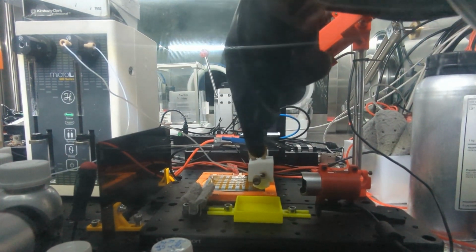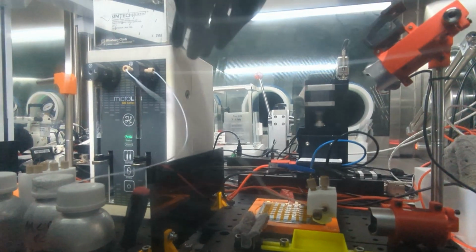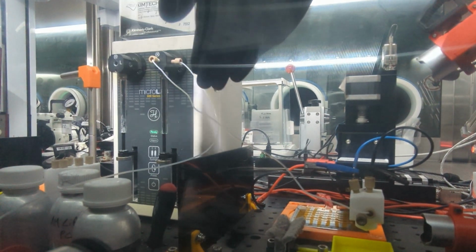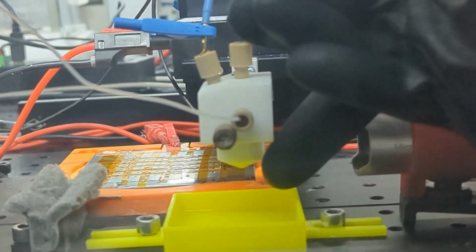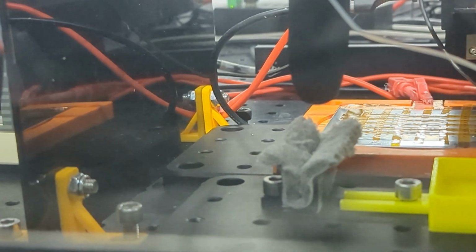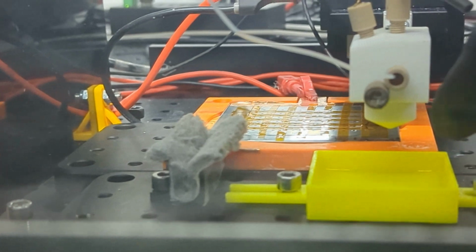The electrolyte is introduced through an inlet which connects to a syringe pump manufactured by Hamilton company, and the user can attach a tube to this pump filled with any electrolyte of choice. The electrolyte is aspirated by the pump and then dispensed from the SDC head into a waste holder. To address the issue of residual electrolyte, which can lead to salt formation and measurement inconsistency, the head moves to a wiping position to remove leftover electrolyte.